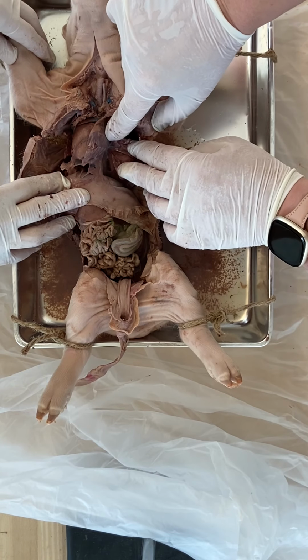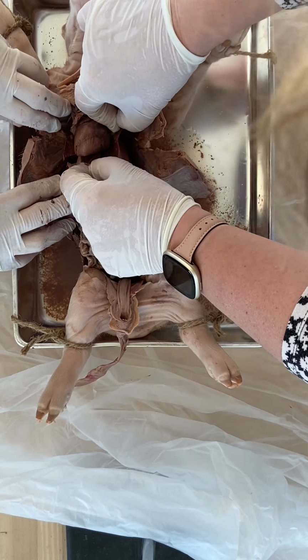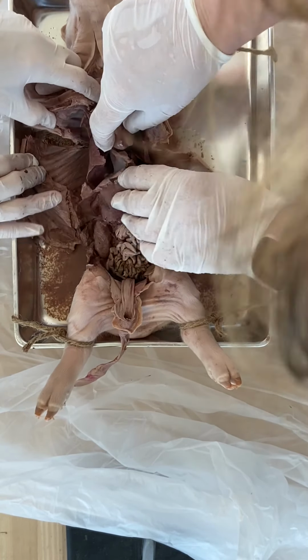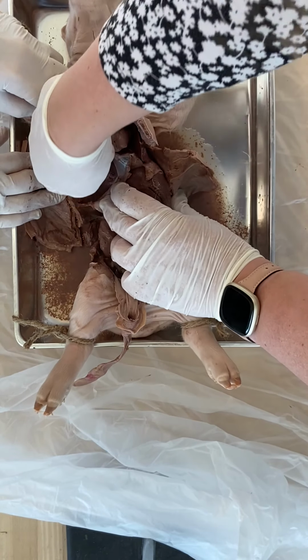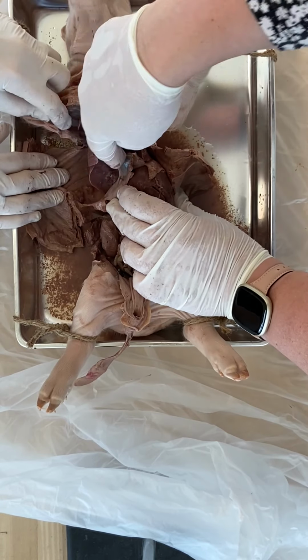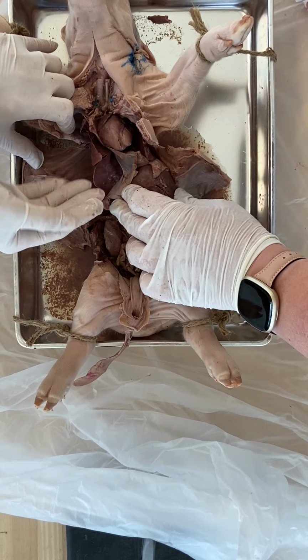And yesterday we were trying to find the bronchus, weren't we? Yeah, it will be. And then where Mrs. March is, that side here is the, let's move all this lot out of the way. And here is the right lung. You can see how far it goes down here, almost to the pig's back, just because of where the lungs are in the pig.